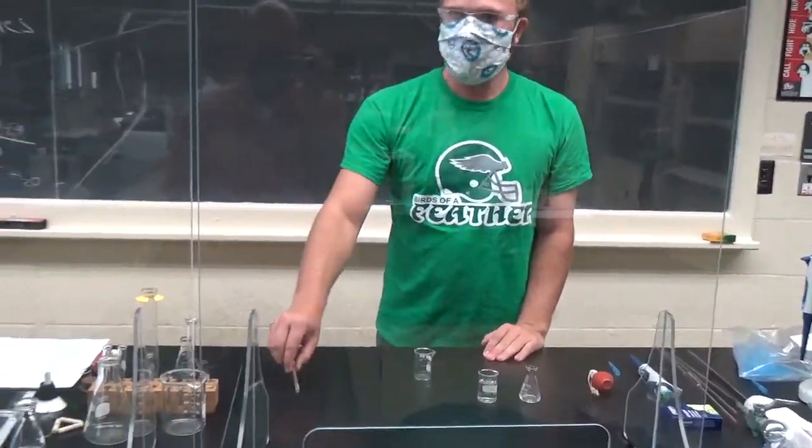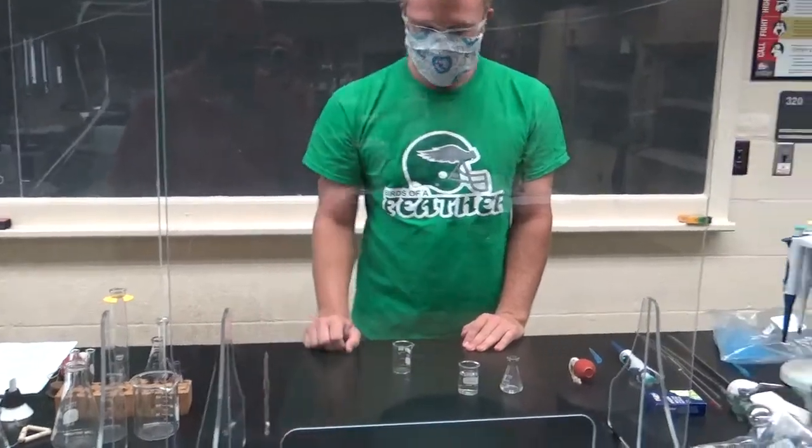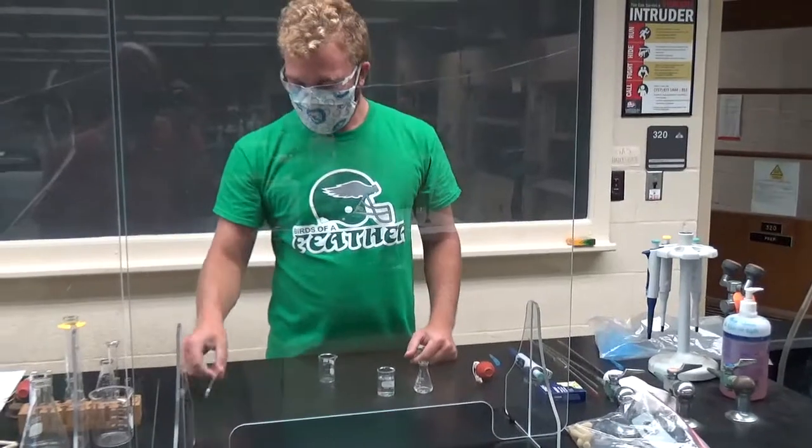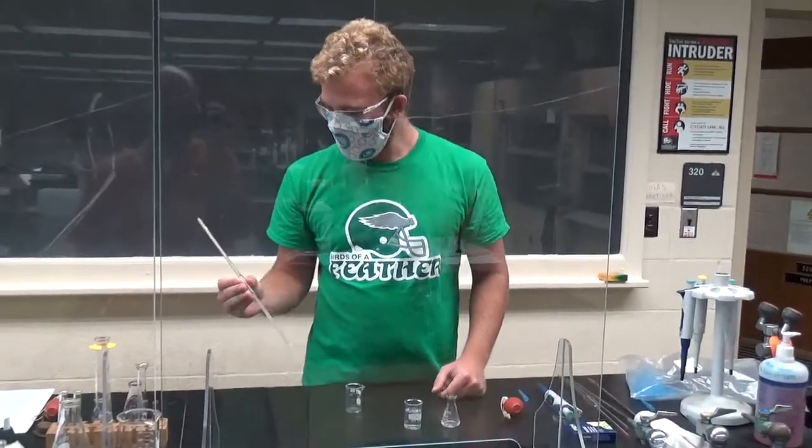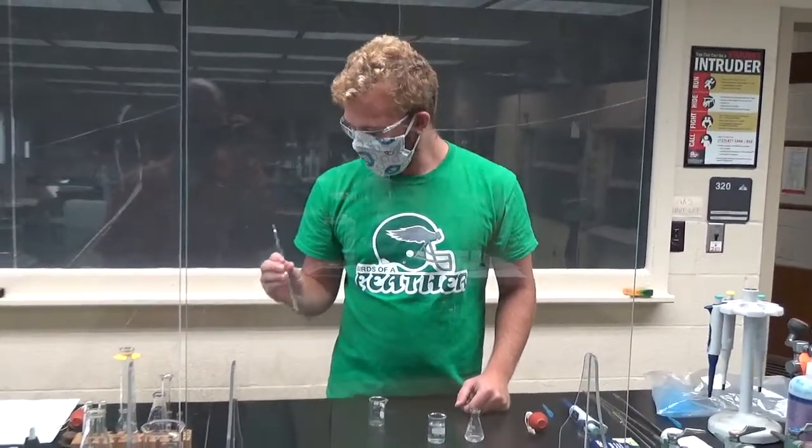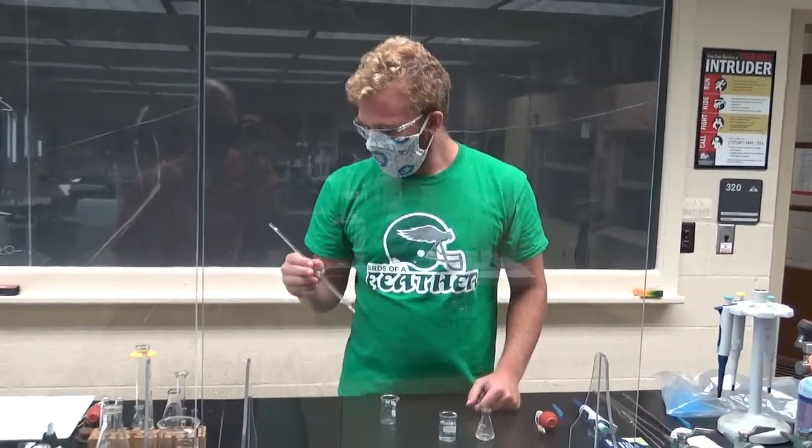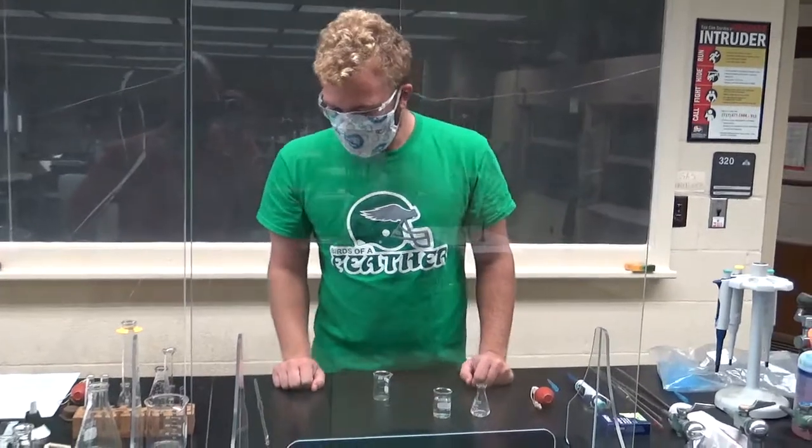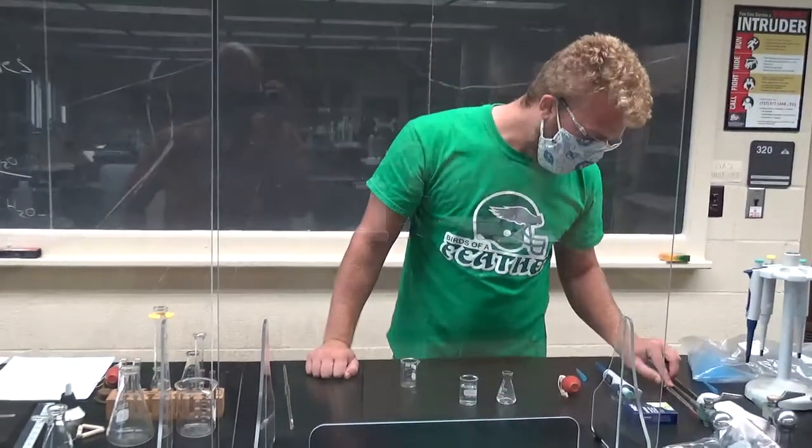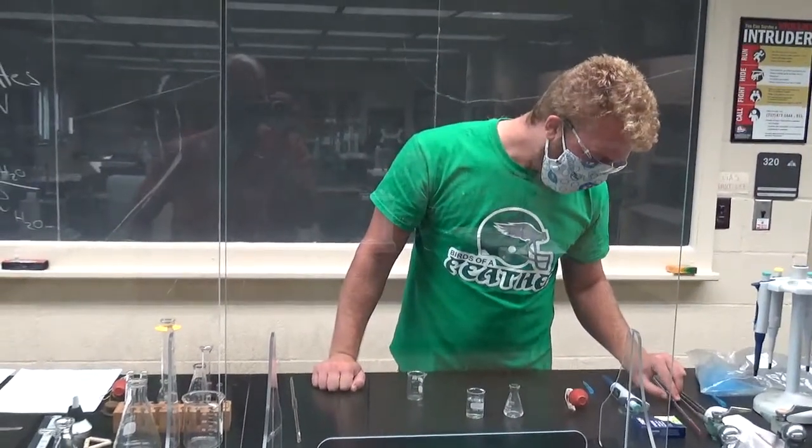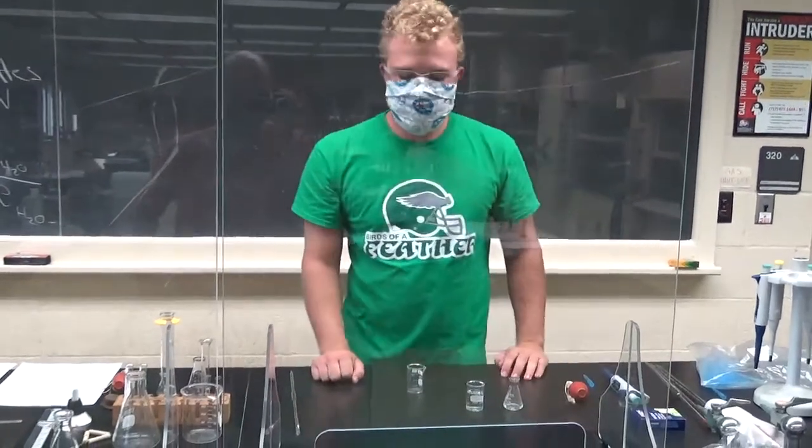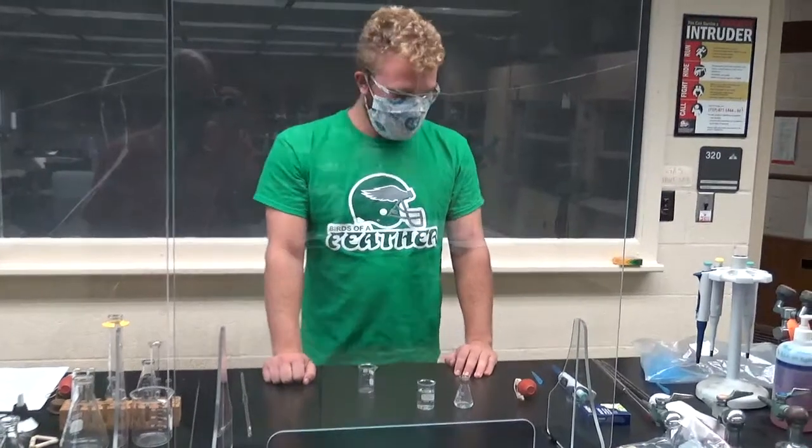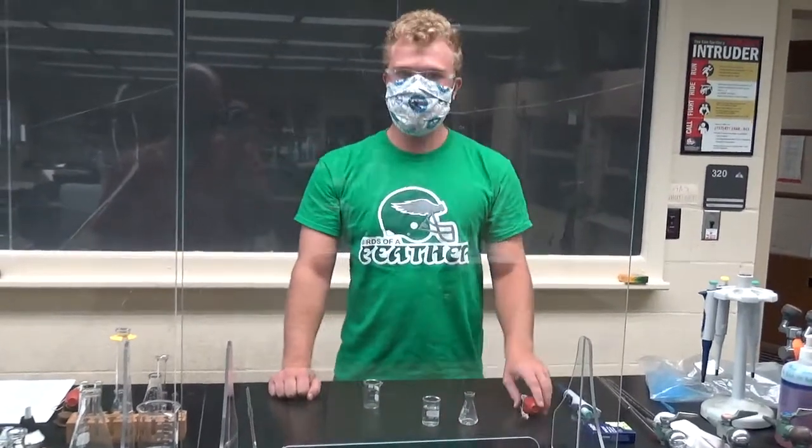Before we move on, I want to point out a couple things about a volumetric pipette. It says 5 ml on the side. It's actually not 5 ml, it's 5.00 ml, three significant digits. It doesn't say that on there, but when you get the meniscus right on that etched line that Wes showed you, it's three sig figs. It's really, really precise for five milliliters and five milliliters only. I forget which size we're doing in lab, but it doesn't matter. Same procedure applies.